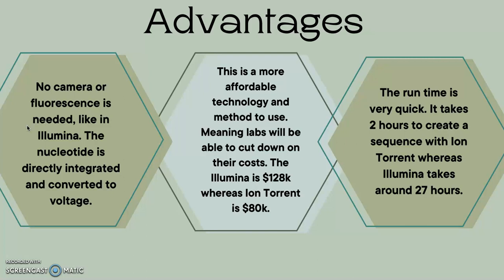However, you also have to be thinking about investing in Ion Chef, so to some this could be a disadvantage. However, on the bright side, compared to other methods, the cost per run is much lower at only $1,000 per run. So overall, I think the cost for the entire system is an advantage in the long run.